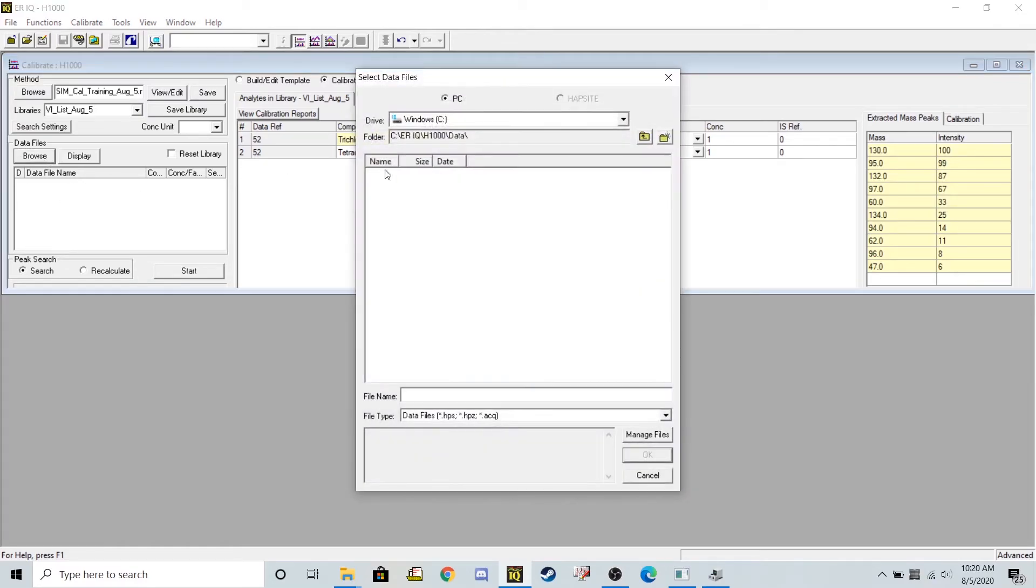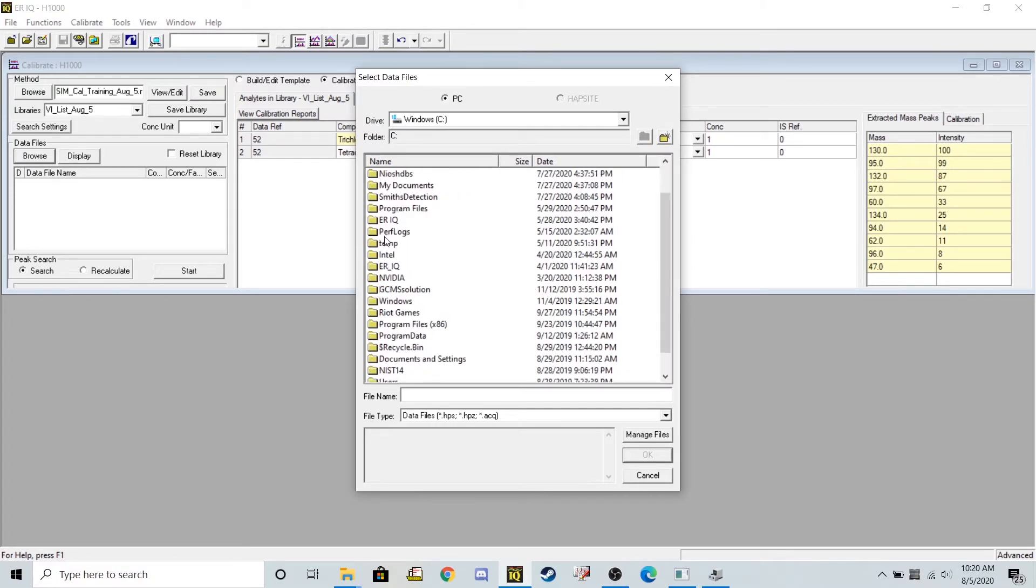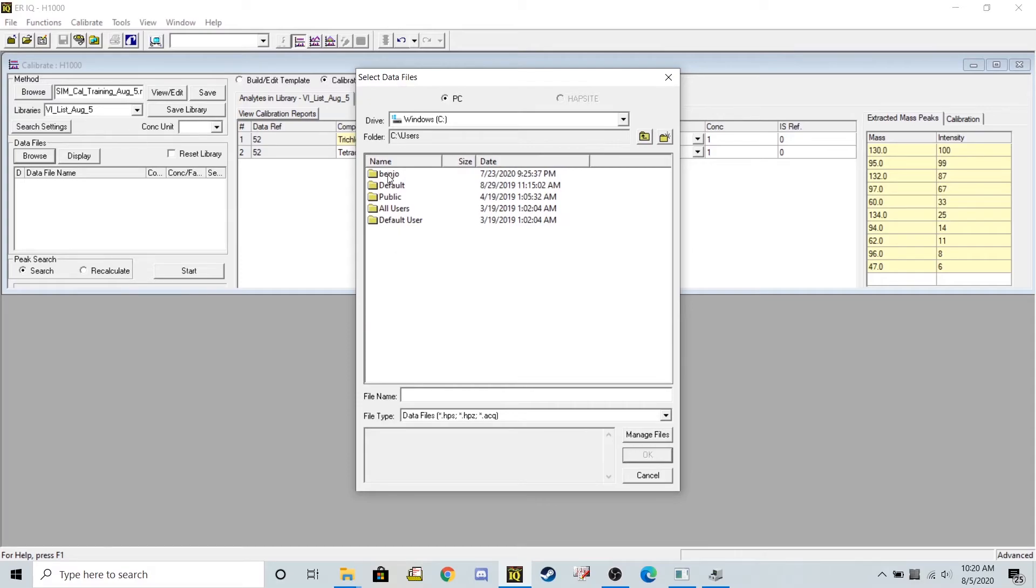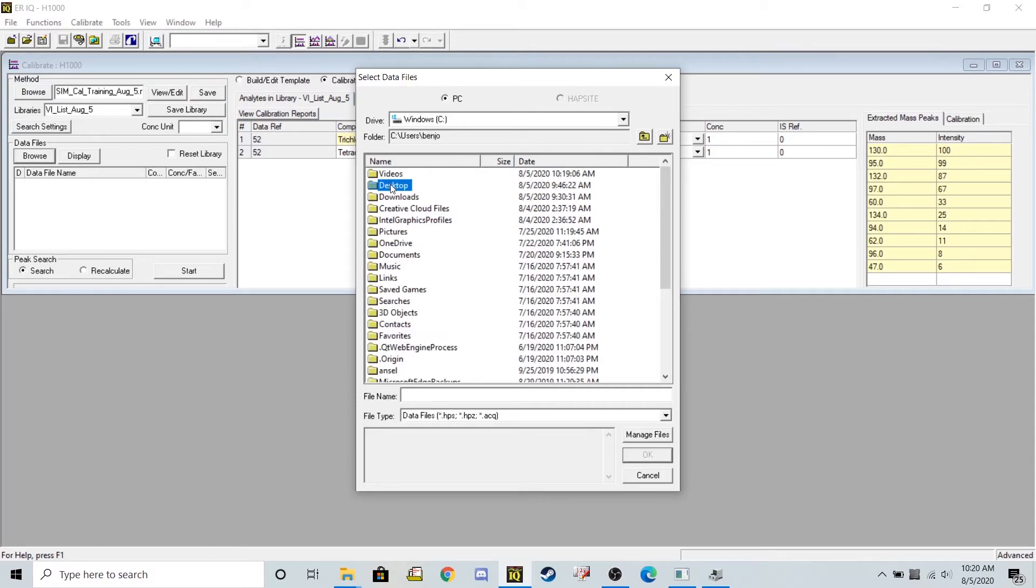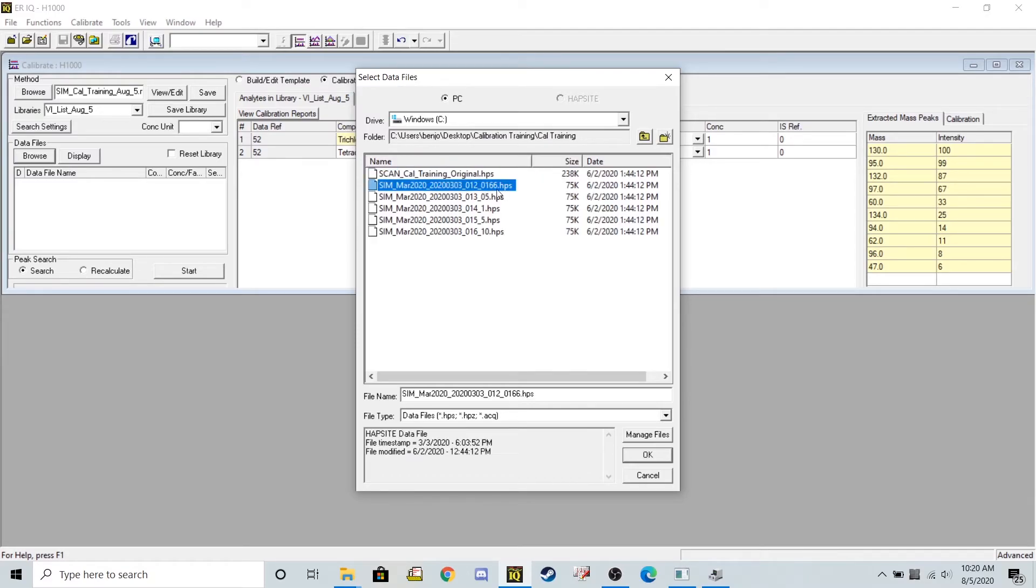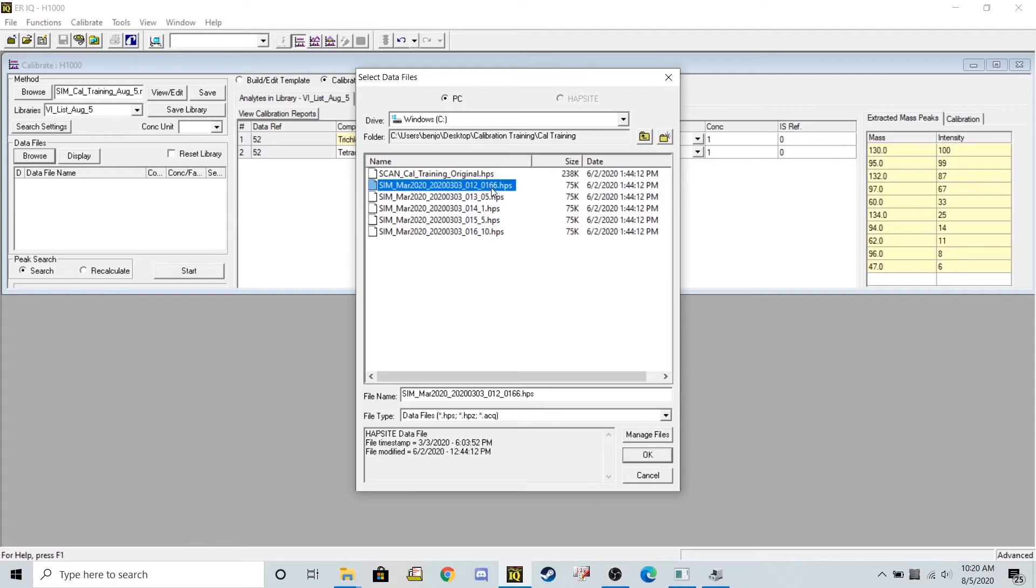And here I labeled them with their respective calibration levels, so I know which ones to load in first.